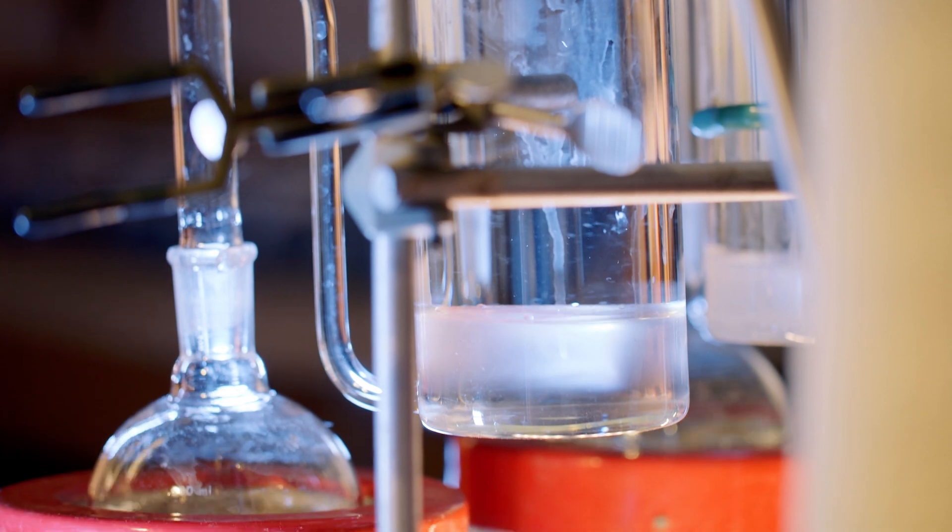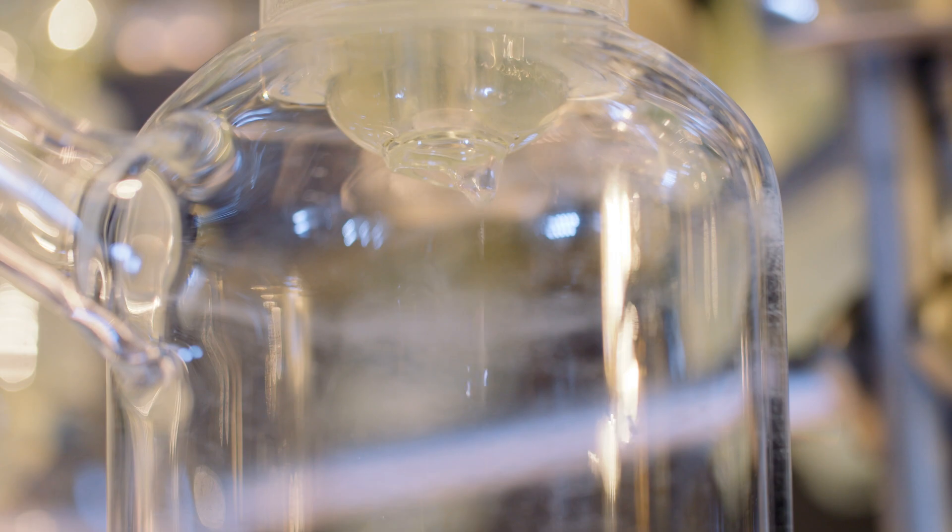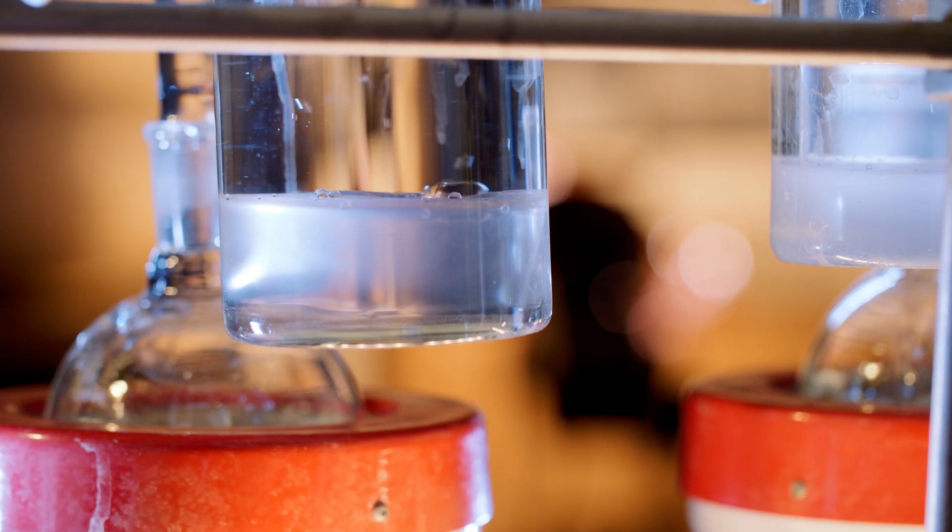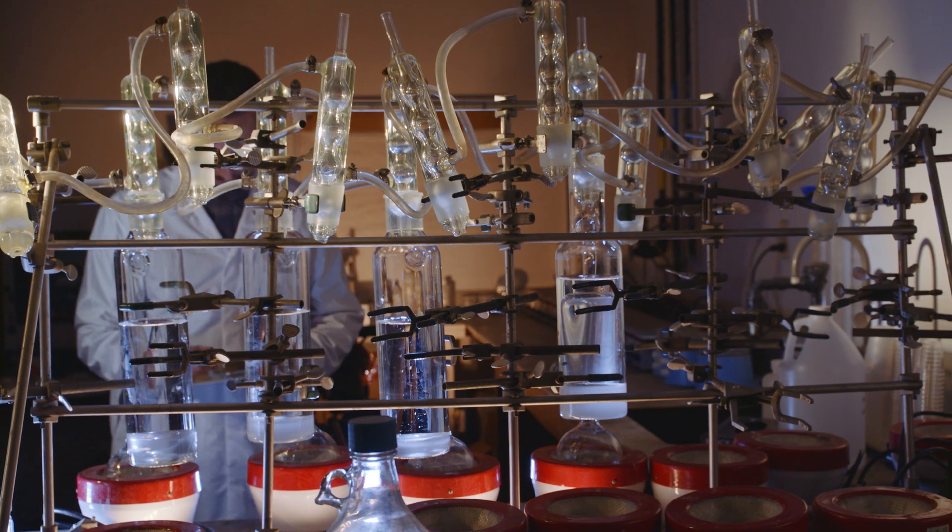And off to various instruments: ICP, ICP-MS, Kona Lab, IC, Smart Chem, TOC, GC, GC-MS for volatiles and semi-volatiles analysis.